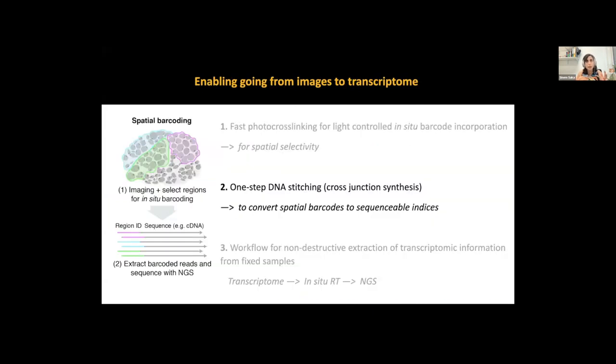And next, we wanted to figure out how we can utilize this cross-linked spatial index to actually read it in a sequencing reaction, because they still have the cross-link, and we need to put them into one strand to be able to read it out by sequencing afterwards.